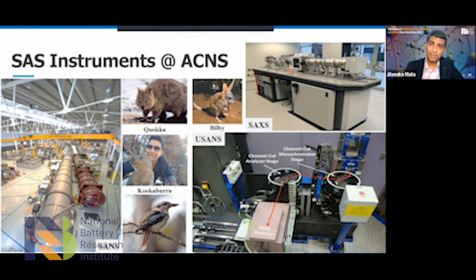We are replacing the SAXS instrument now. We are getting a very new, really nice SAXS instrument, which also has USAXS capability. So when you apply for beam time for any instrument, you can combine multiple instruments for one research problem. Okay. So far so good.